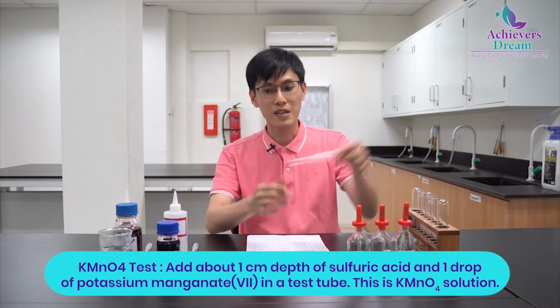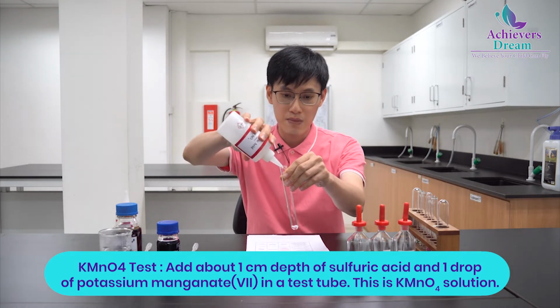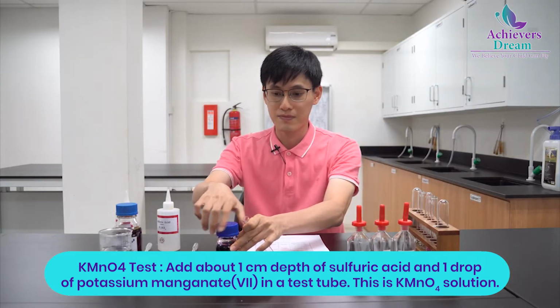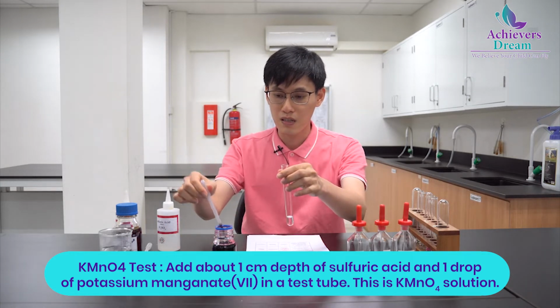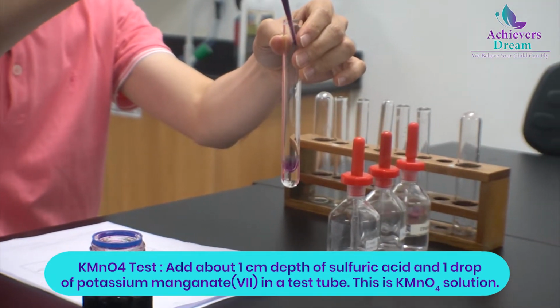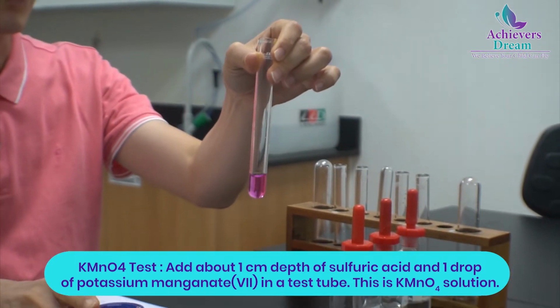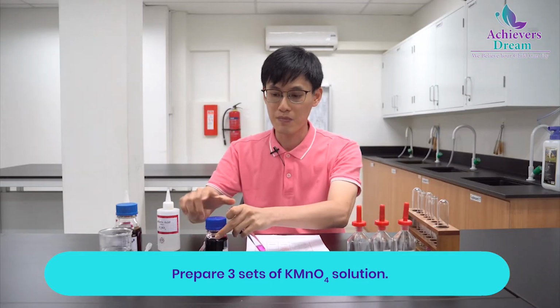So for the KMnO4 test, what we will do is we will add about 1 cm depth of sulfuric acid in a test tube. And we will add 1 drop of KMnO4. Take care not to add too much because the aim of this test is to observe the decolorization of the purple KMnO4. If you add too much, it will be much harder for it to decolorize.